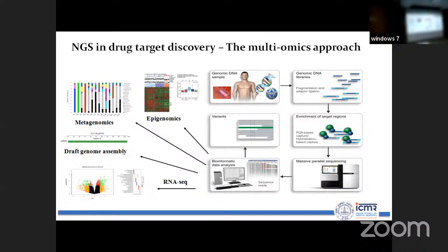To which organism. That is what the phylogenetic analysis will be doing. Okay. So basically, you get the whole genome of the organism, or are they broken? In metagenomics or any NGS technology, the goal is different. Okay. So when you are going for assembly, you get whole genome.